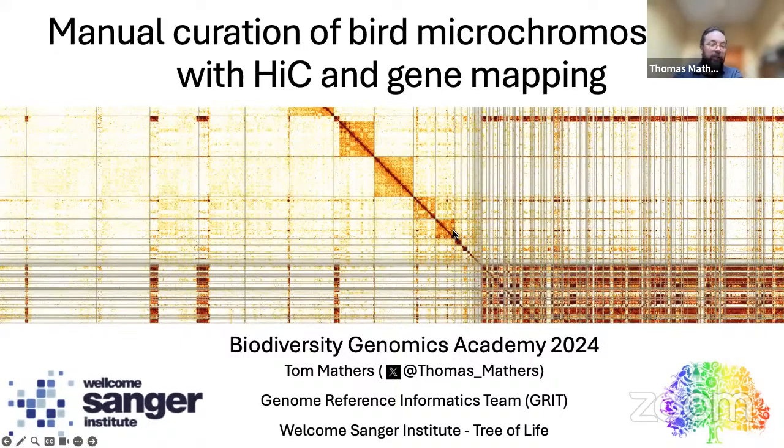Welcome to the workshop. So we're going to talk today specifically about how to curate bird genomes and in particular the curation of bird microchromosomes, which in PacBio HiFi assemblies are particularly challenging. So the idea of this workshop is really to focus on the biology of the microchromosomes, how we curate them in Pretext.